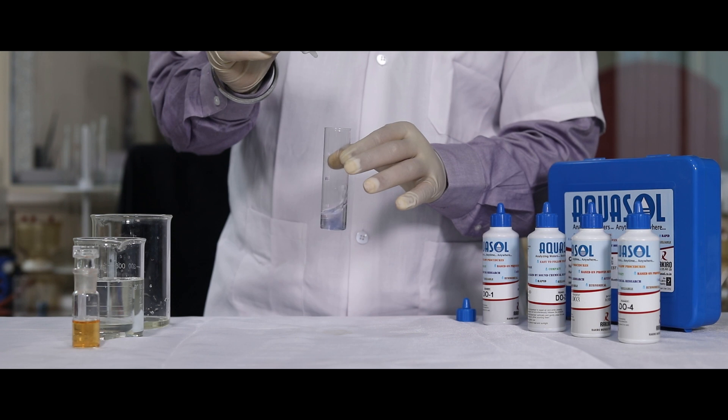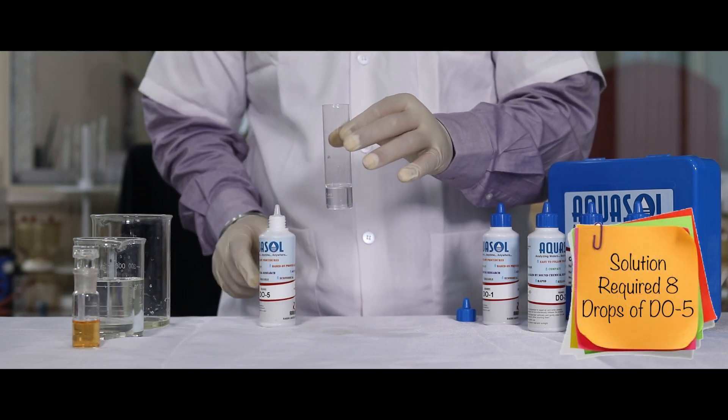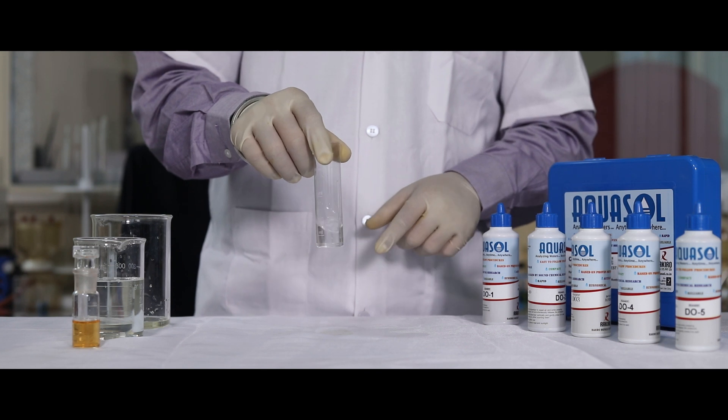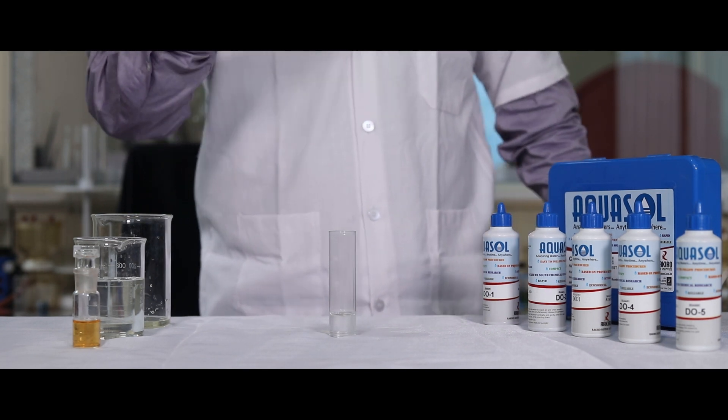For example, in this test, 8 drops of DO5 reagent was added. That is, 8 multiplied by 0.5 is 4. 4 is the ppm of the sample we tested. You can check the DO in different ranges.